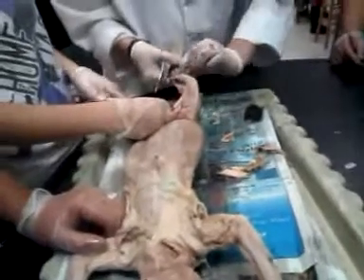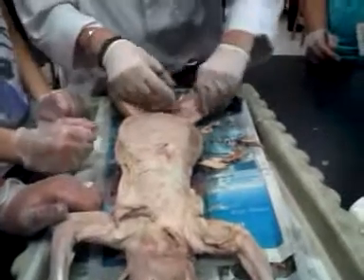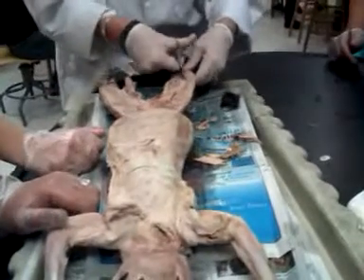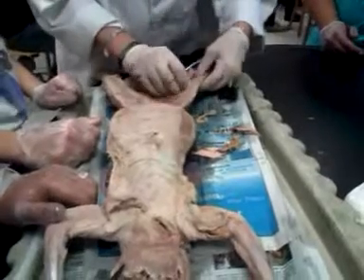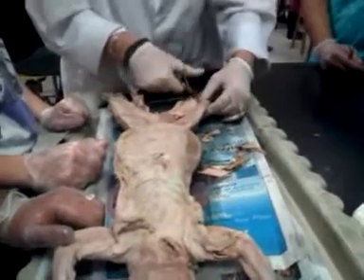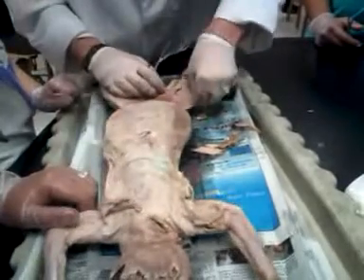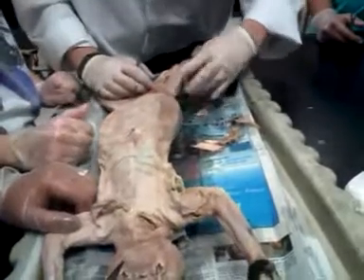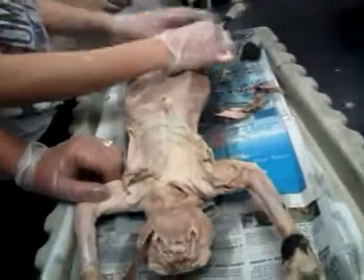Is this your adductor? Okay, yes. This is your adductors right here. But look, let me show you this. I'm just going to cut this here, and I'm going to pull it back. You got to get that top one off. So you're cutting as close as possible to the bone, and then as you pull it up, you're going to see all kinds of... But you got to get this craziness off right here. Once you pull this up, you're not going to believe how many muscles are underneath.